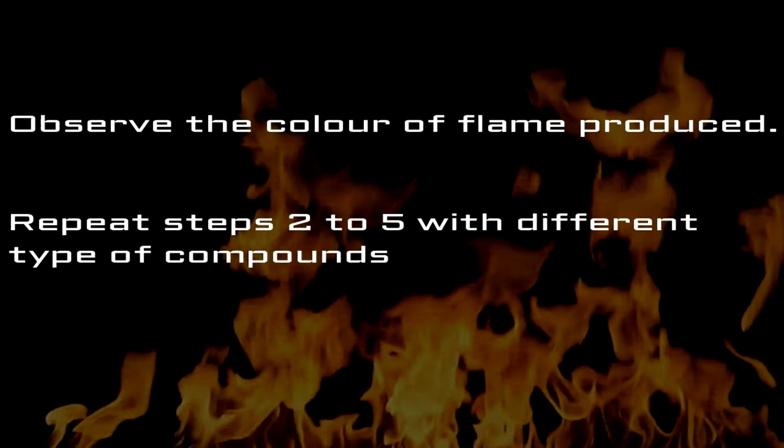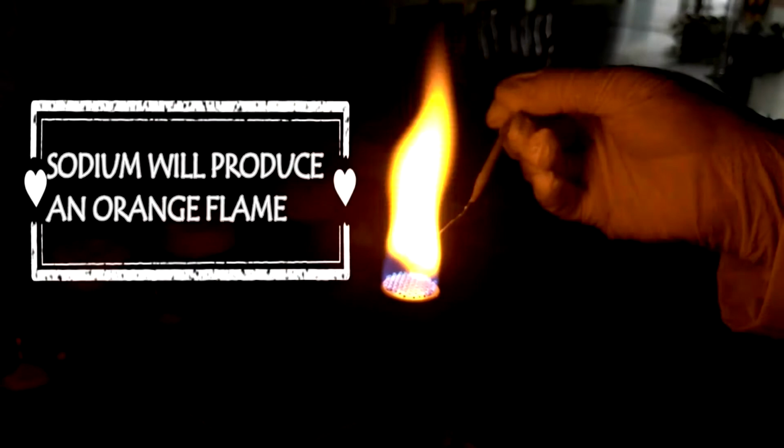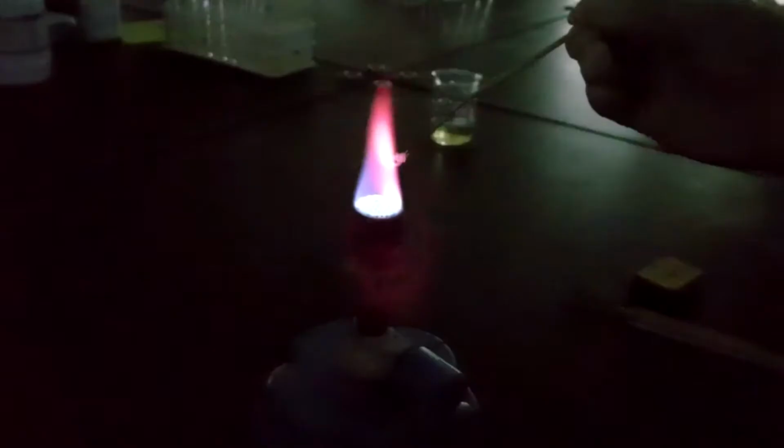Observe the color of the flame produced. Repeat steps 2 to 5 with different types of compound. Lithium will produce a red flame. Sodium will produce an orange flame. Potassium will produce a lilac flame.